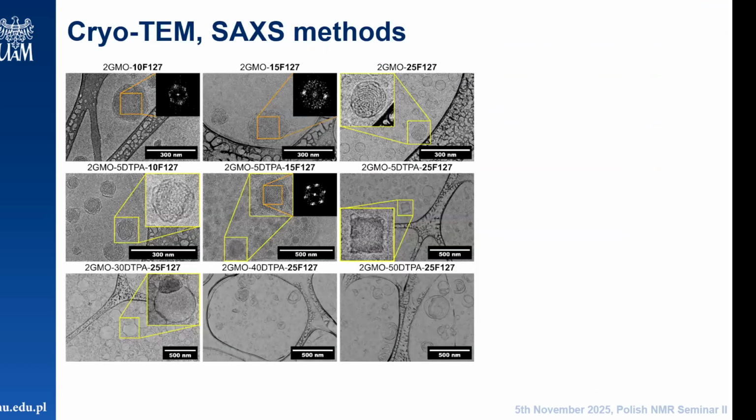It's very good. We also used cryogenic transmission electron microscopy, because it's very important to know what is inside our samples. For the unmodified system and the one with low concentration of gadolinium, we can observe a highly ordered periodic internal structure like cubosomes or hexosomes, but we can also observe other self-assembled systems like liposomes and so on.